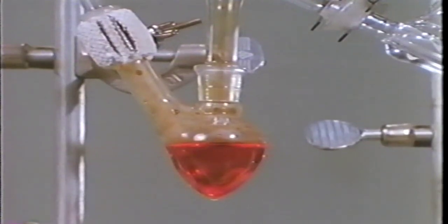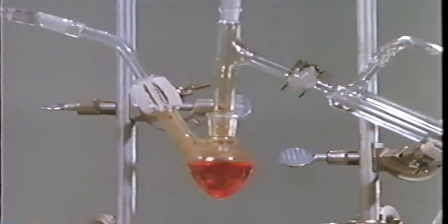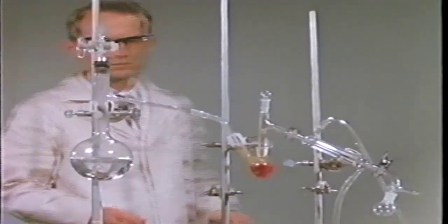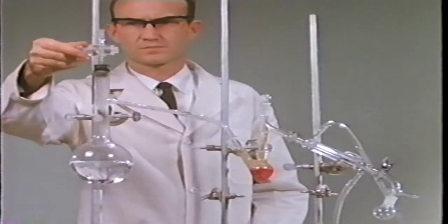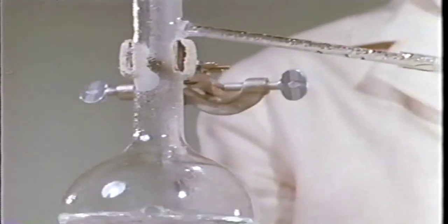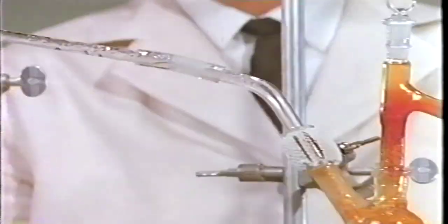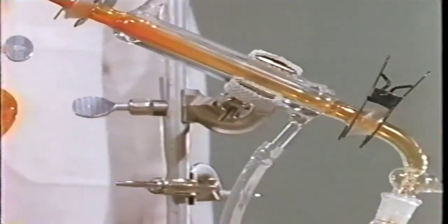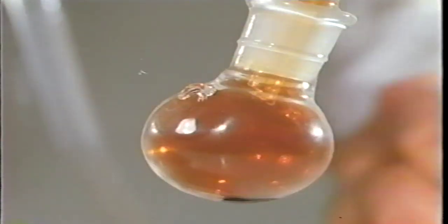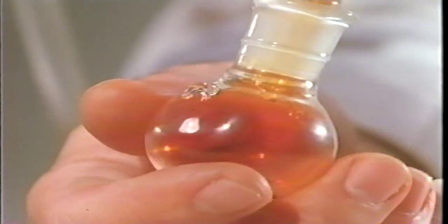Since our goal is to obtain elemental bromine, how do we now remove the bromine from the water in which it is dissolved? We could sweep it out with air, as we did before, but to minimize loss of bromine into the air, we'll use live steam, produced in this flask. The steam condenses as it passes into the solution, raising the temperature. Because bromine is more volatile than water, bromine distills from the solution. Relatively pure bromine condenses and collects in this receiving flask.